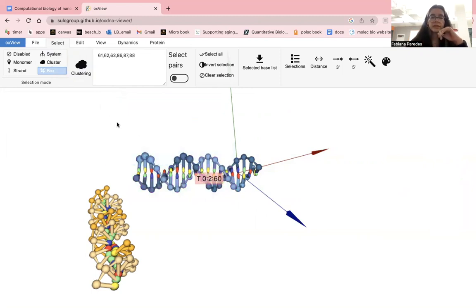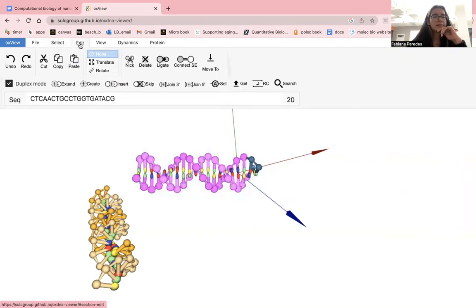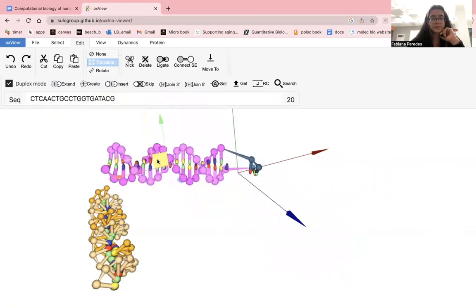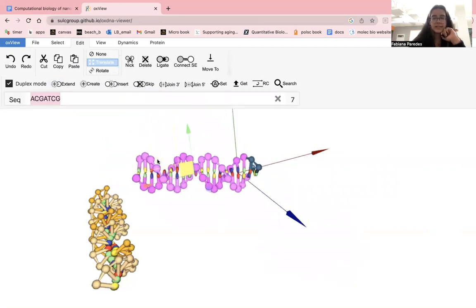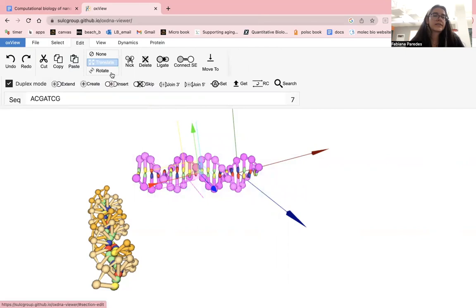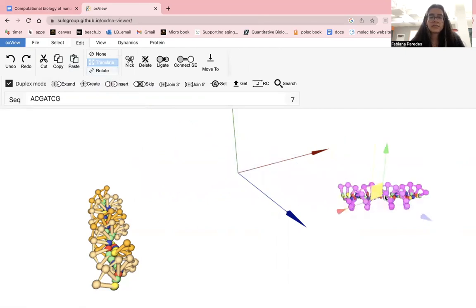So when you move it around, once you click on translate, it will show you that it's still connected and you're leaving some behind. So you can do Command C or Control C, and then you're good. So let's make sure we select the whole thing. Okay, and now we can move it around successfully. There we go.